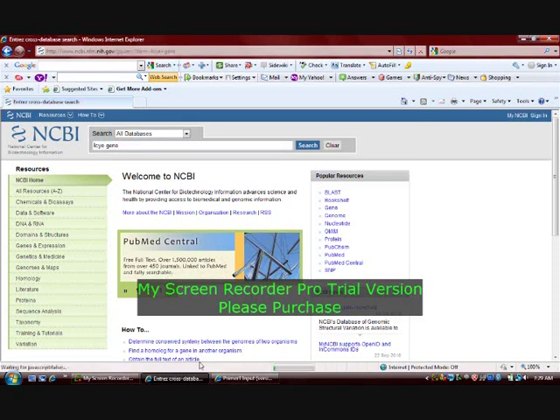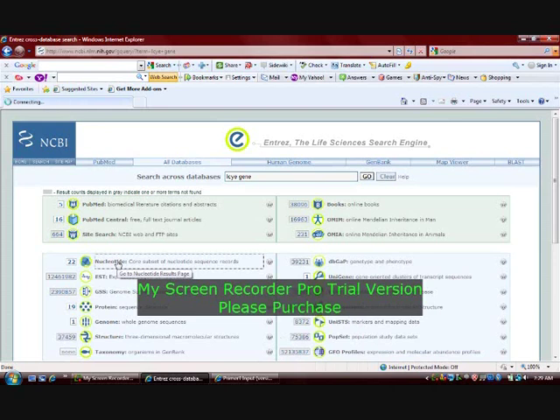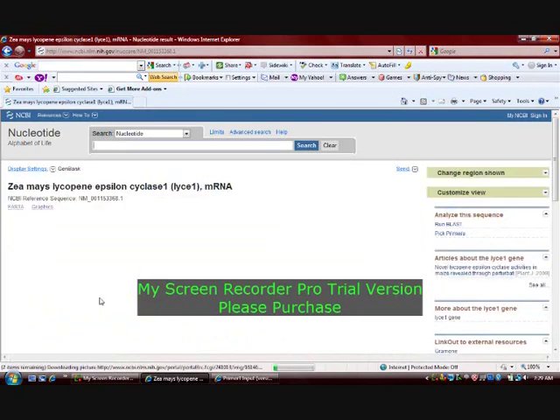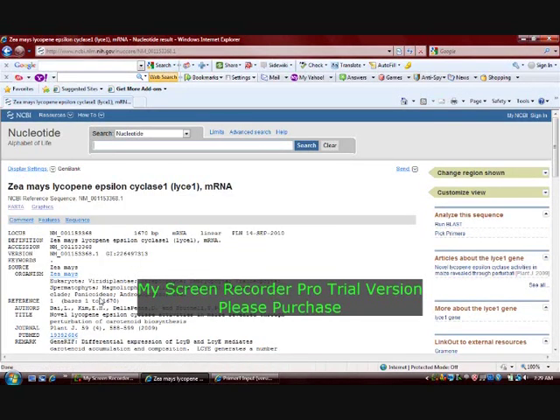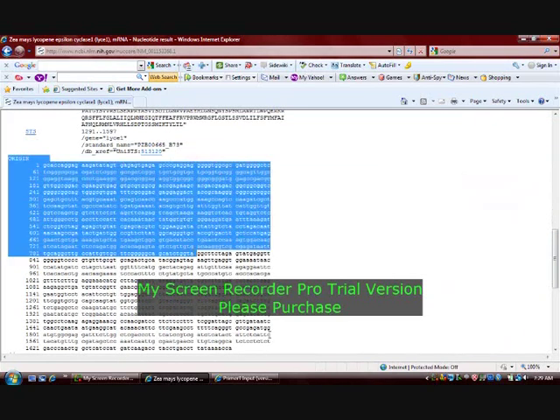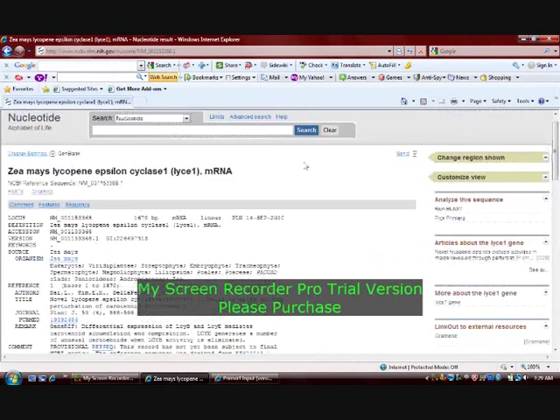From the search results page, we choose the sequence of Zea mays as that is the gene of interest. A page displaying the accession number, locus, gene of interest, source organism, title, and author is displayed. As we scroll down, we can see the sequence available in GenBank format. Another format called FASTA format is also available, and we choose the FASTA format as that is the input format read by Primer3 software.